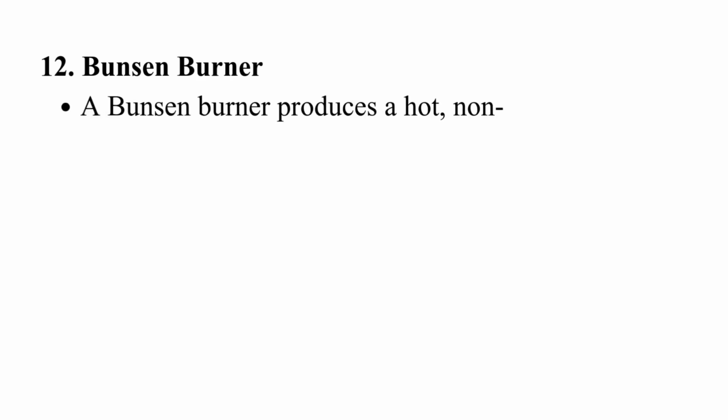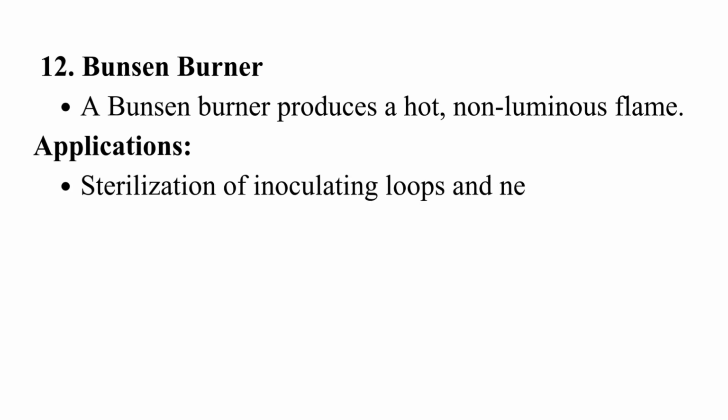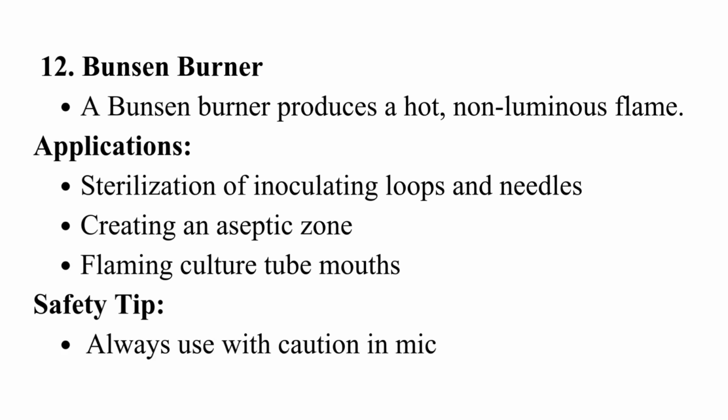Bunsen burner. A Bunsen burner produces a hot, non-luminous flame. Applications: sterilization of inoculating loops and needles, creating an aseptic zone, flaming culture tube mouths. Safety tip: always use with caution in microbiology labs.